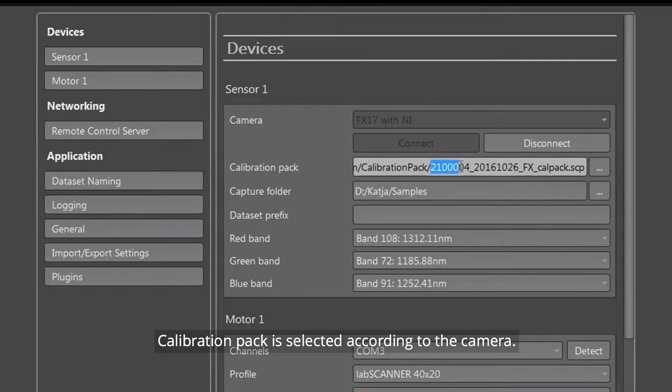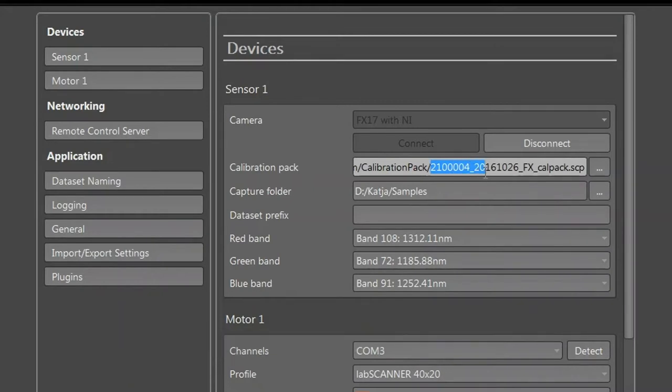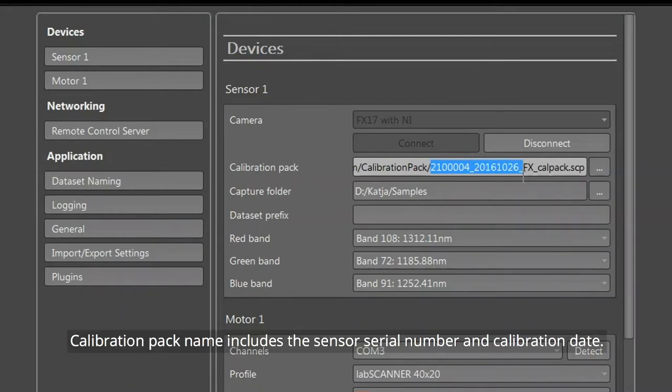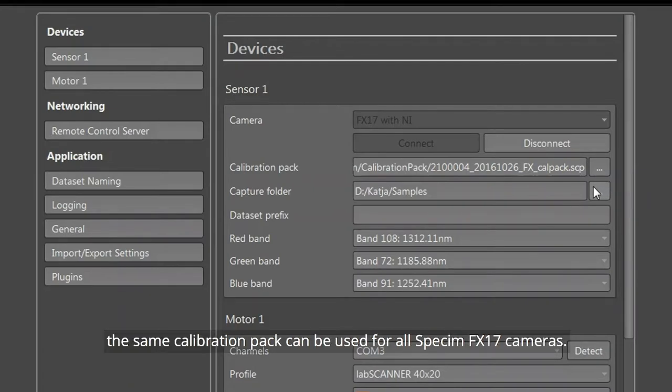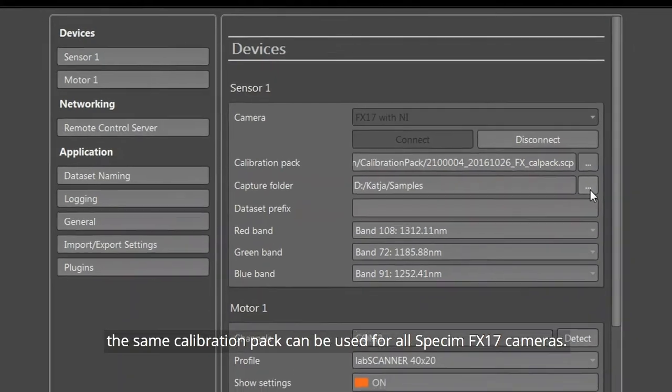A calibration pack is selected according to the camera. The calibration pack name includes the sensor serial number and calibration date. If there is a postfix FX-Calpack, the same calibration pack can be used for all SPEC-IM FX17 cameras.